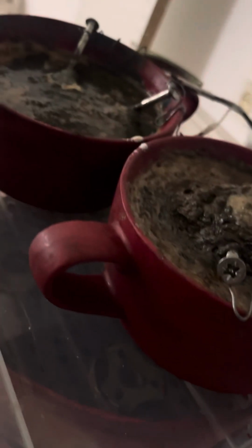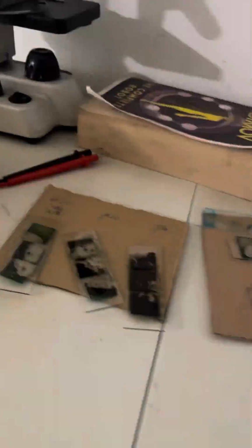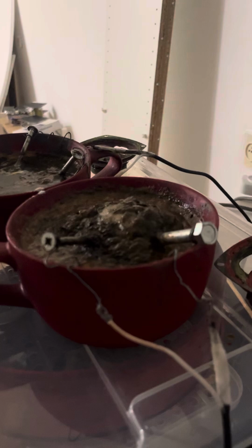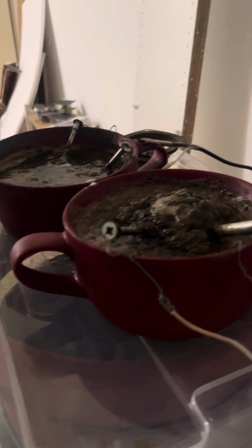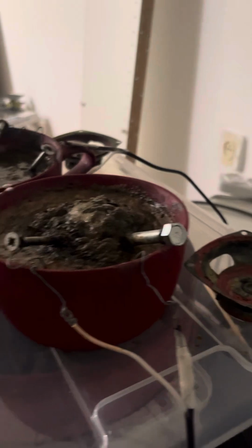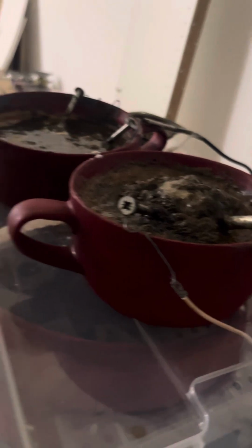Good morning. So this will be a microscopic examination of actually quite a bit of slides. I mean, at least 8. We're in the middle of an electrolysis experiment, quite an elaborate one. Many steps are planned, so it's actually only the first step, but we already have quite a bit of things to see, to watch, to enjoy, you know, the results.